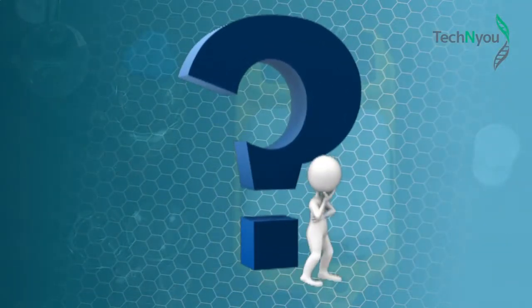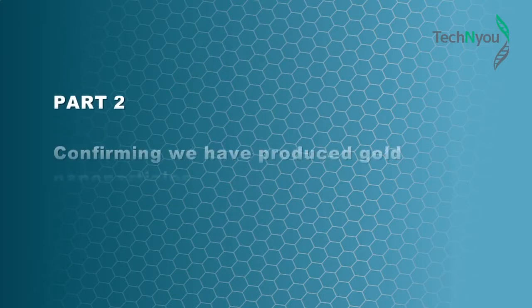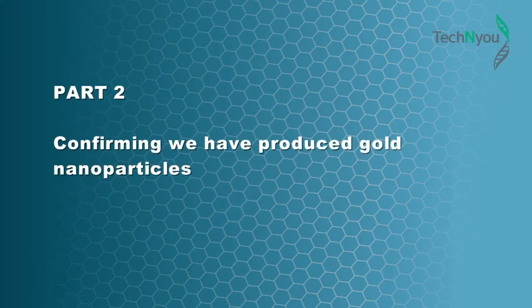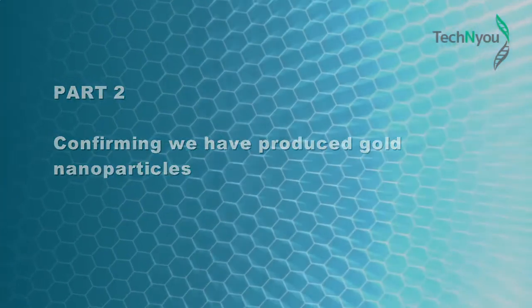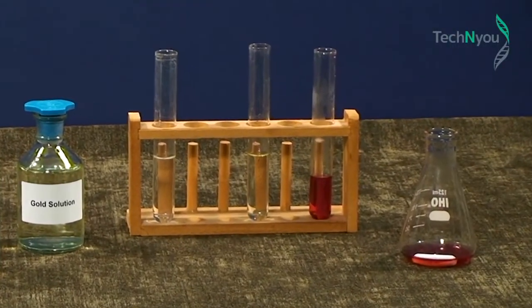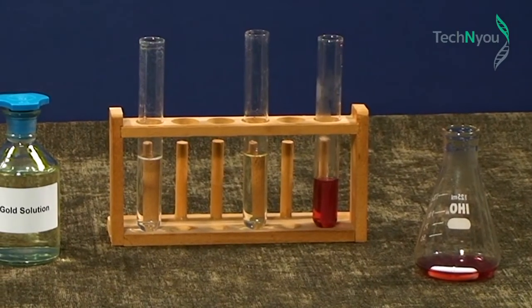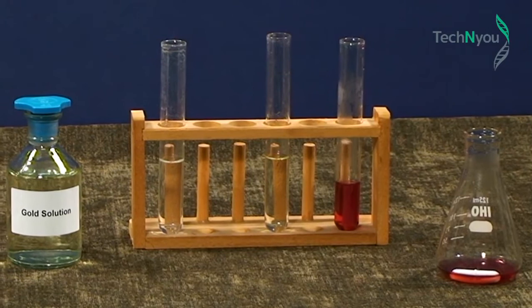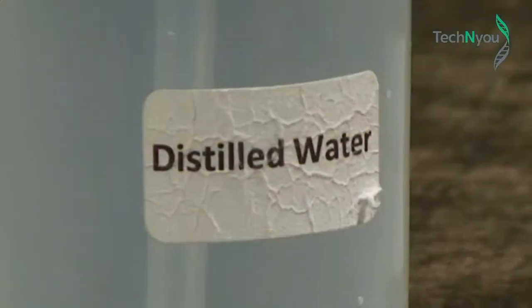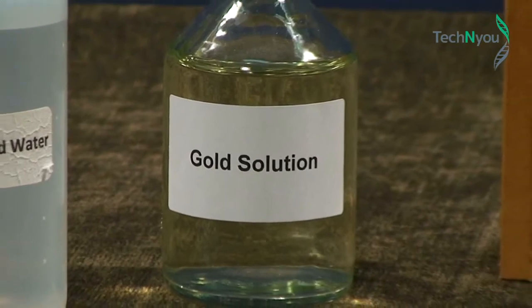How do we know the nanoparticles are present? Let's look at the prepared nanogold solution. First, remove the red solution from the stirrer. Allow it to cool and then transfer some of this solution into a test tube. Pour distilled water and gold chloride solution into 2 other test tubes.